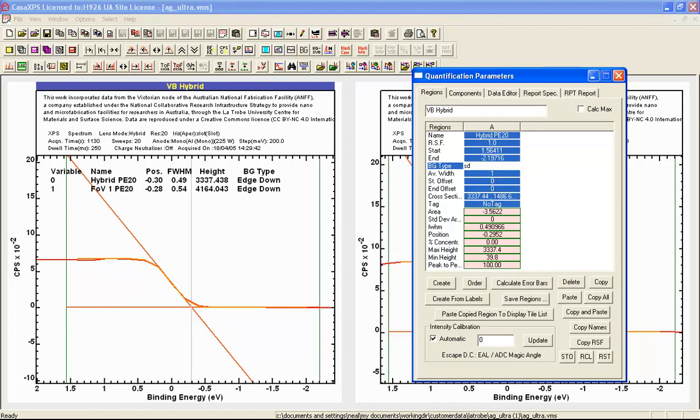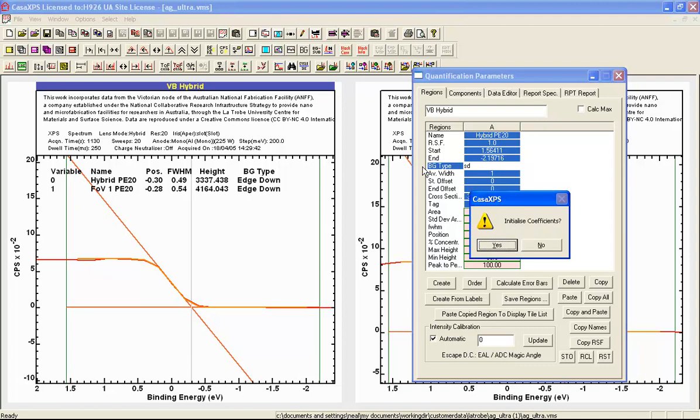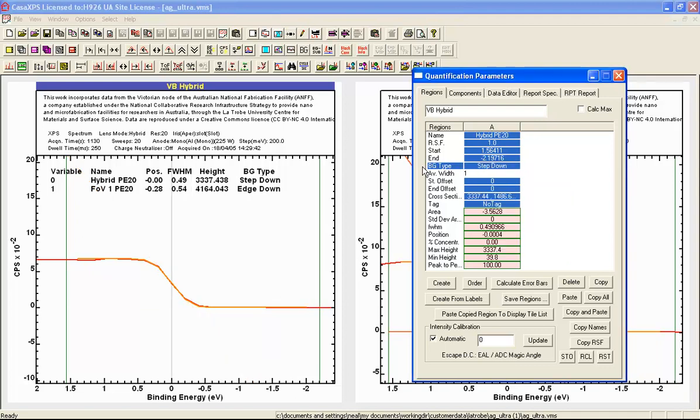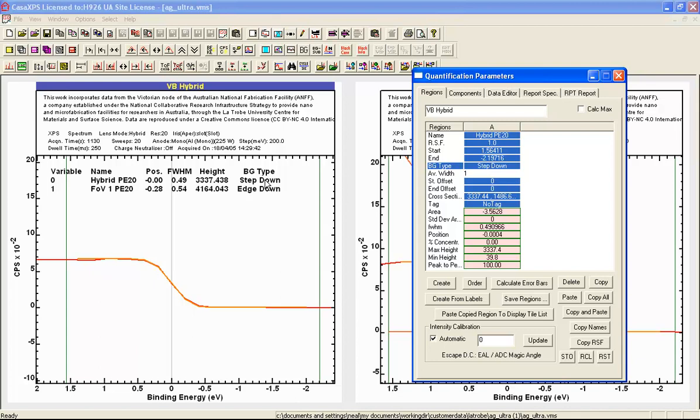And when I press return after entering SD for step down, and I don't need to initialize the coefficients because the same complementary error function is used for both edge down and step down, then rather than seeing the position as defined by the intersection of those two lines, we get the point of inflection or the maximum of the Gaussian that corresponds to this error function. So we can see now for this one, the position when I've got a background type of step down is then indicated by this point here, the point of inflection, very close to zero.